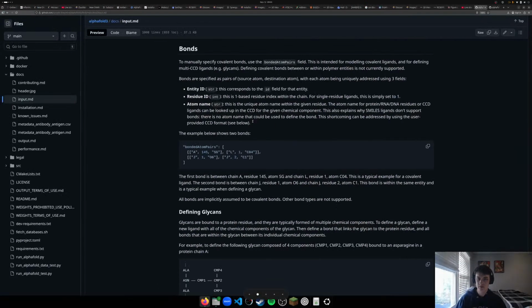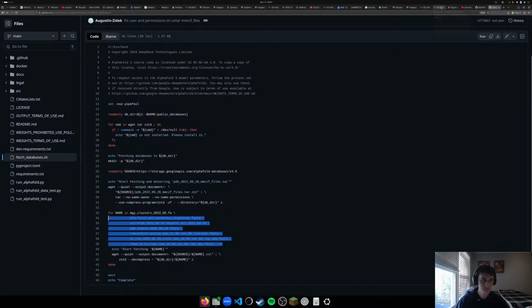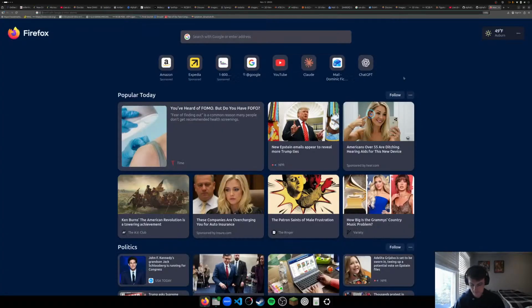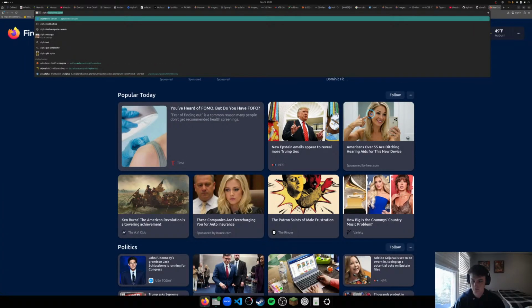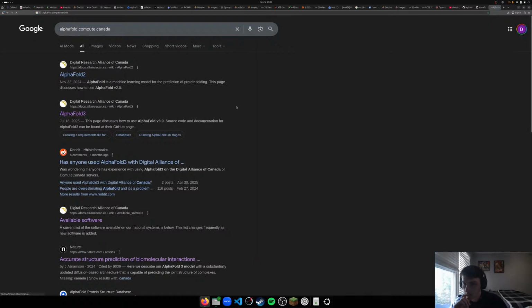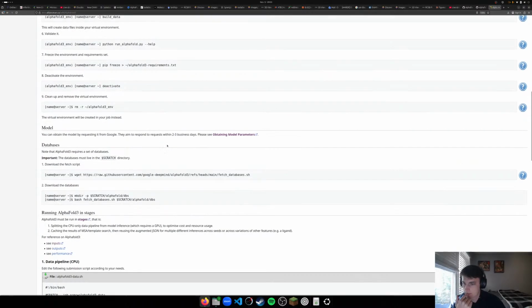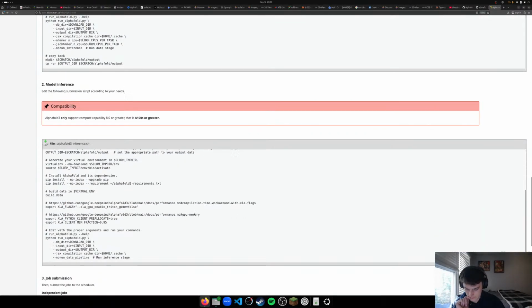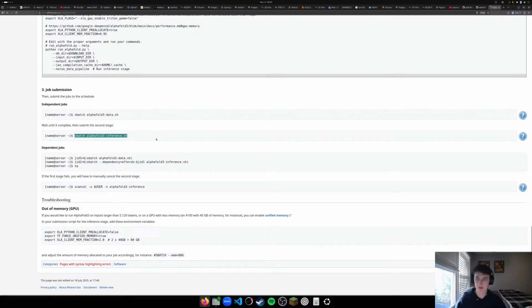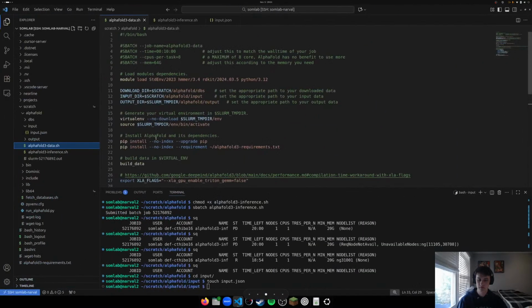Wait, what's the first thing we do? Oh, so dispatch data. Wait until then submit the second stage. Okay, so the second stage is inference. So what did I do? Oh, I did the inference first. So that's wrong. I need to do data.